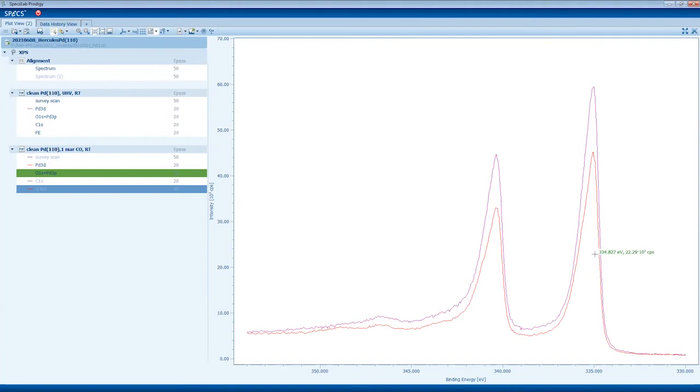I mean, maybe higher, but not lower. It is seen only when you overlap spectra and normalize them to the same area, and then you see this small change. In CasaXPS it is quite easy to normalize and display those spectra all together. Okay.